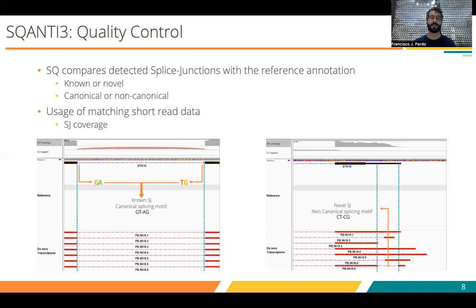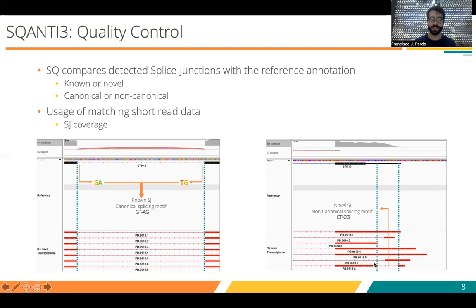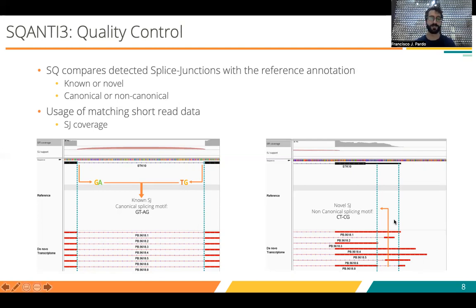SQANTI can also make use of matching short-read data. So if you have not only PacBio sequencing but also Illumina sequencing or any type of short-read data, you can try to validate individual splice junctions. In this example, the known canonical splice junction has a lot of coverage from the short-read data, which is not the case for the suspicious splice junction.